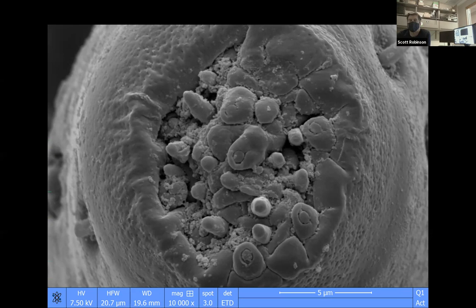So we have light microscopes, we have electron microscopes, we have X-ray microscopes, and then we have lots and lots of pieces of equipment that help people prepare their samples for those various kinds of microscopes. We also have microscopes that allow us to stain samples with different qualities and colors of stain, and we can do lots of different kinds of fluorescent microscopy. So people, instead of using solid stains now, use fluorescent stains, and then we can collect the fluorescent images of the samples. So people are looking at cells and tissue and seeing how they respond to different kinds of treatments.